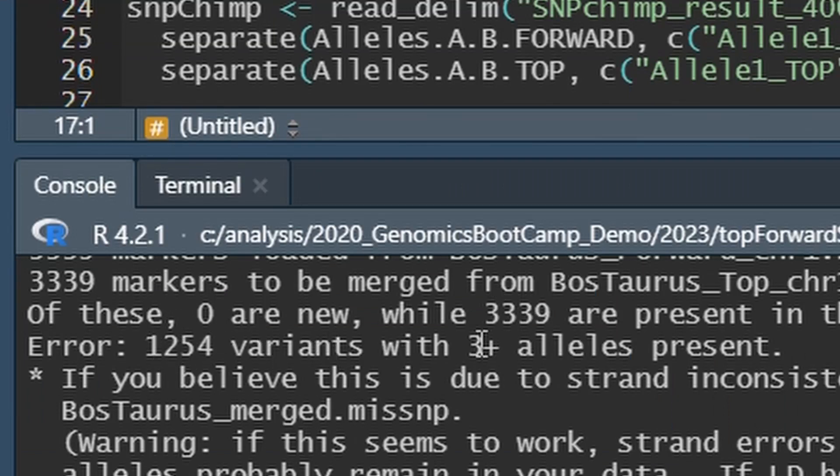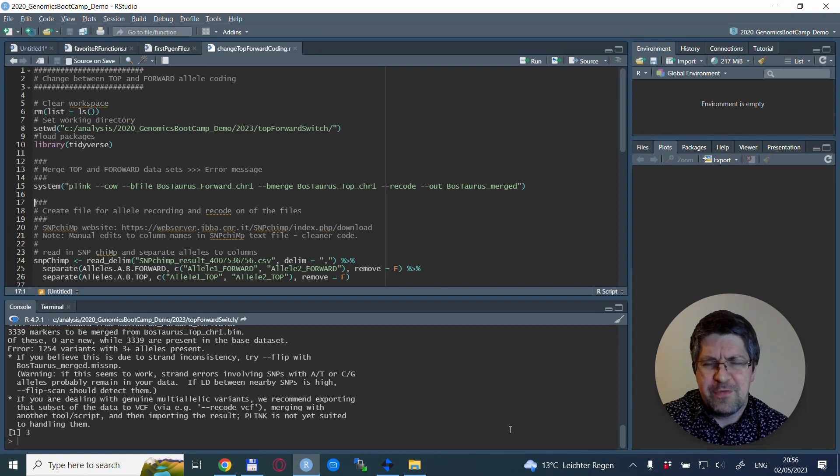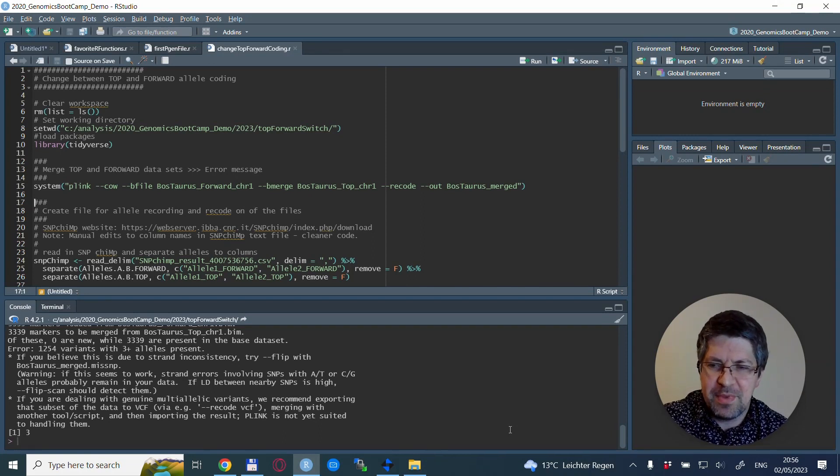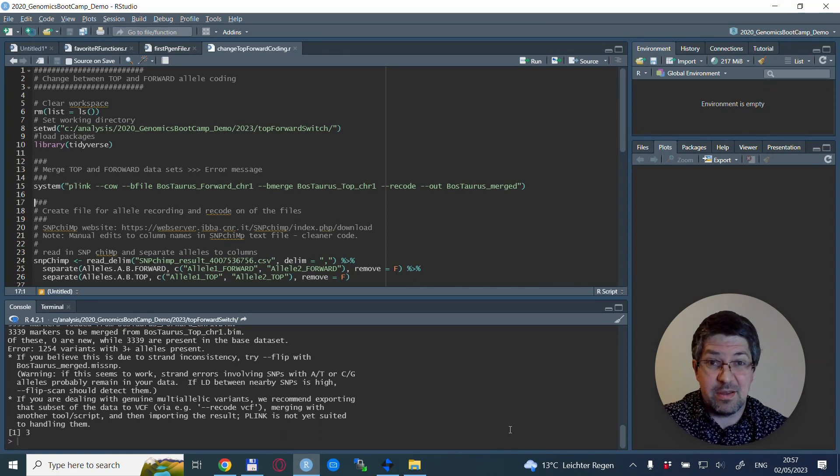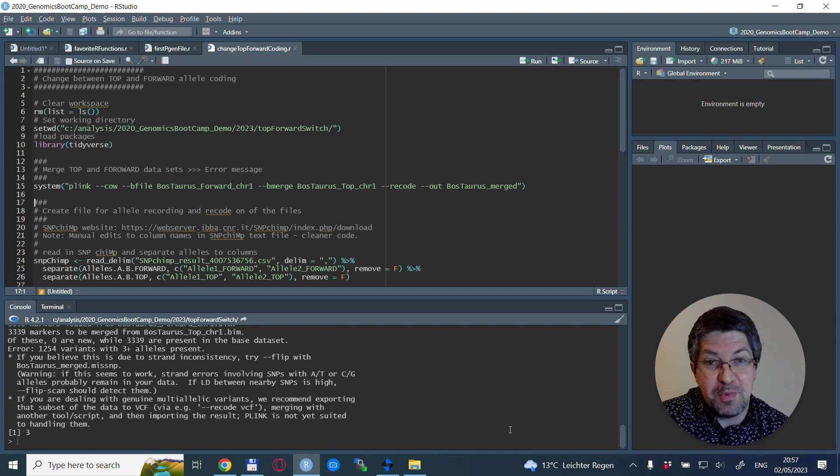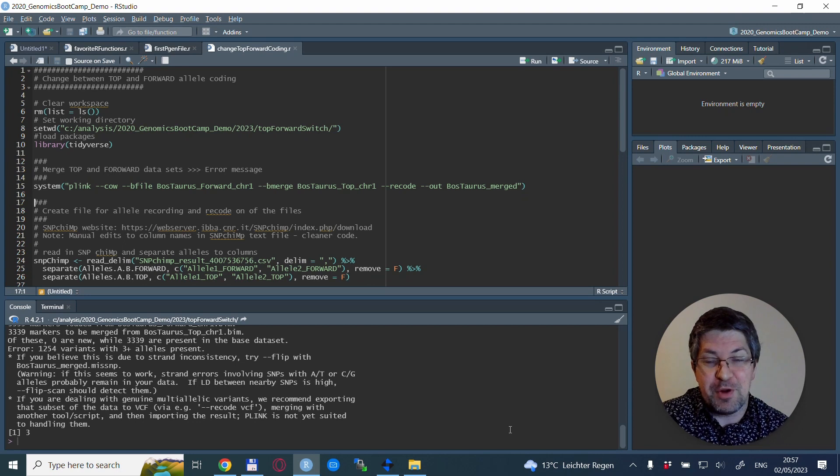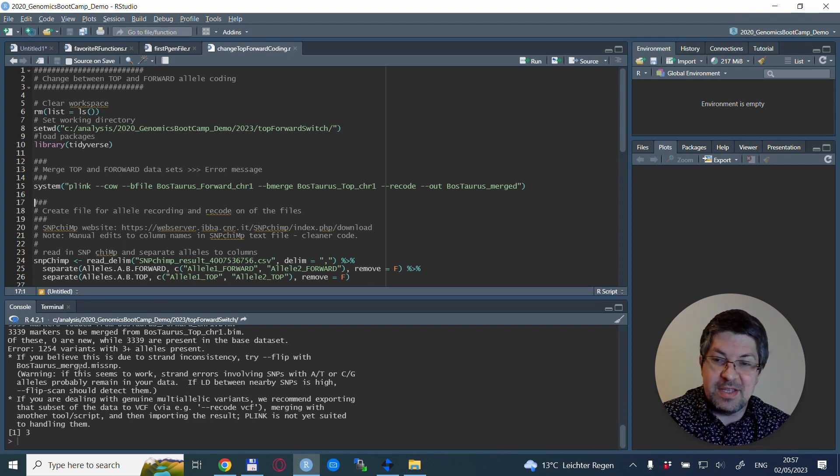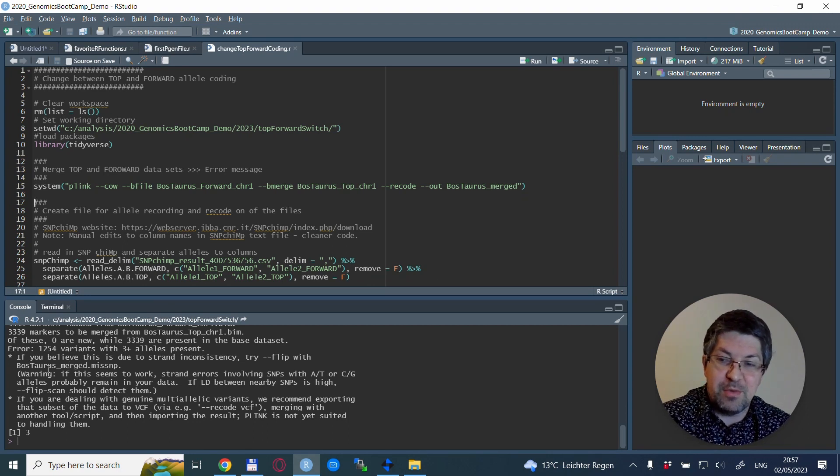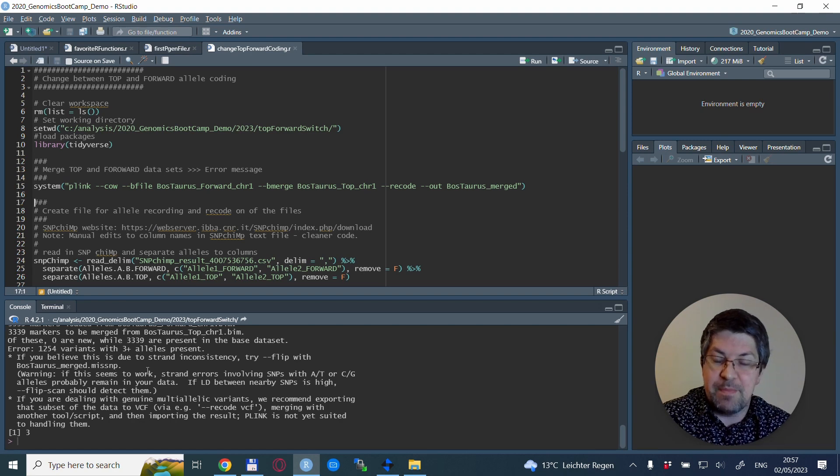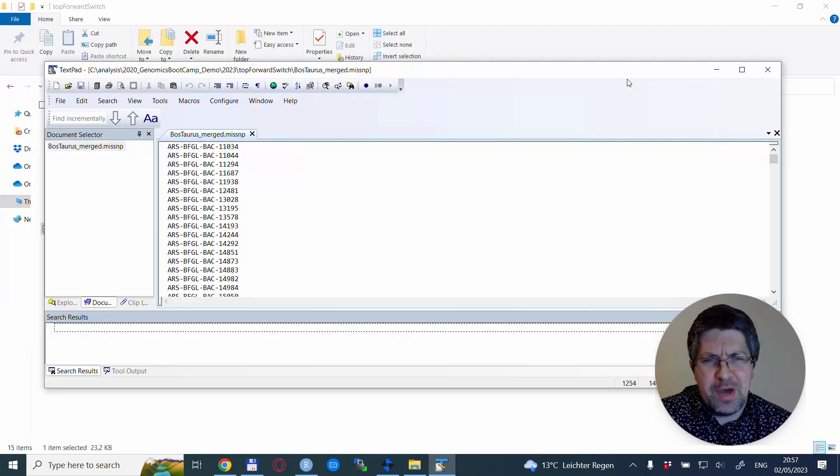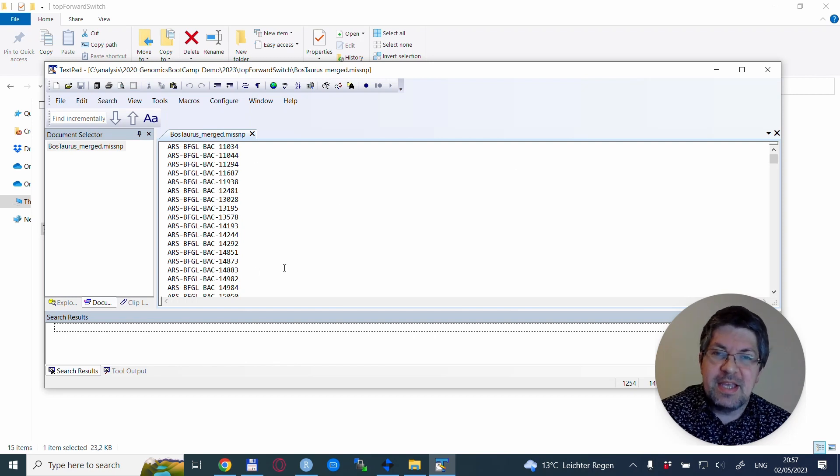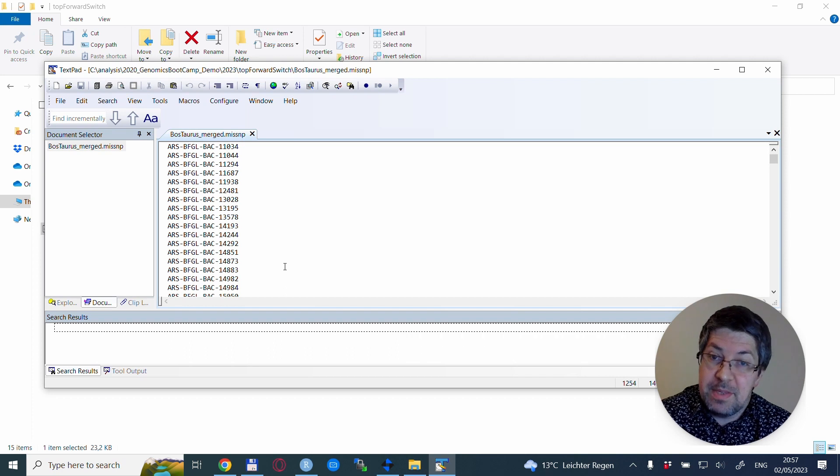PLINK offers a --flip option but from my experience this doesn't solve it. You can check what the exact problem is by looking at the merged miss SNP dataset. It has a bunch of SNP names - these are the problematic ones.